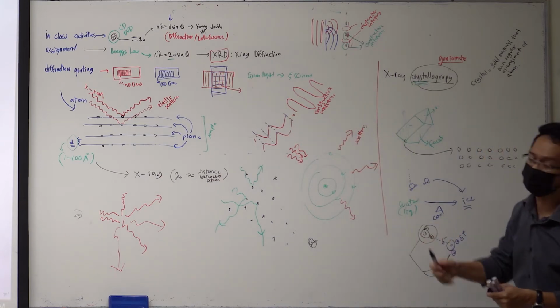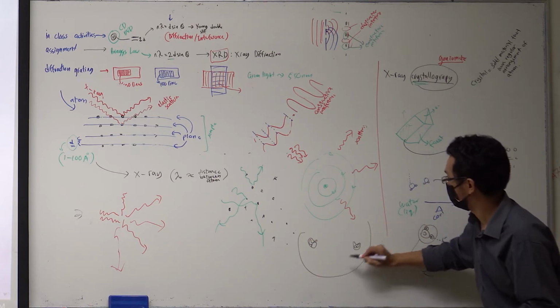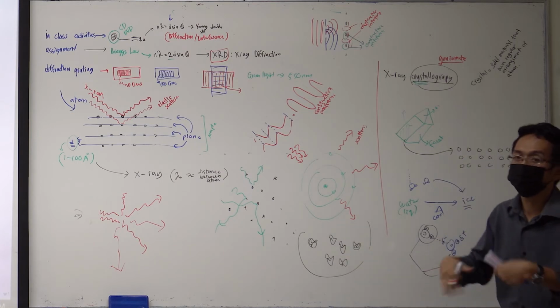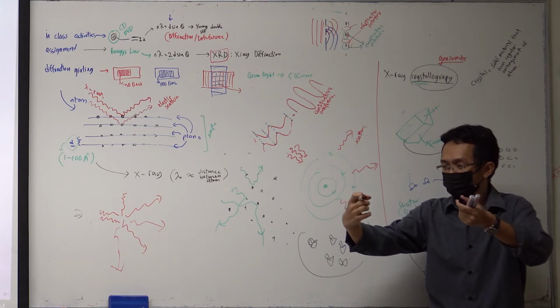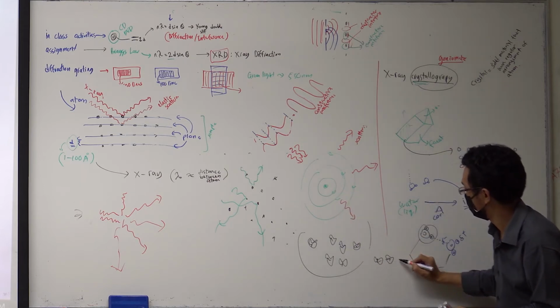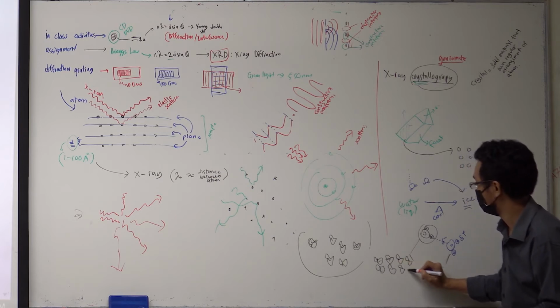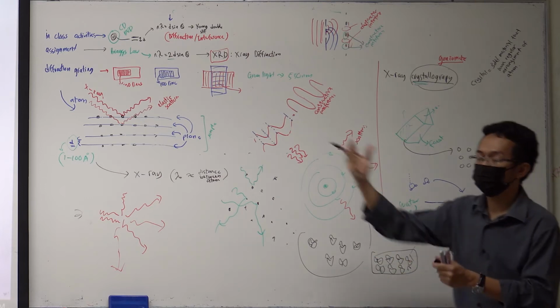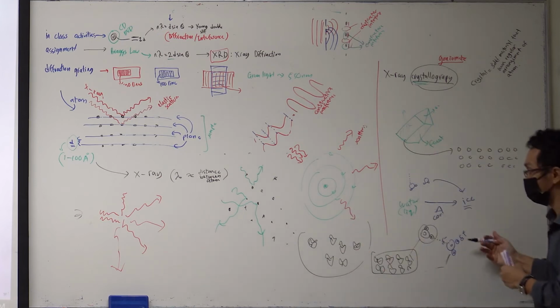So what they do is they gather a lot of protein, they put in liquid, a lot of the same protein, and then when this same protein is cooled down, evaporated, it will be like a Lego, trying to find its match. It means they try to arrange themselves like that, and then you get the crystal, you get the solid protein. So from this, you put it in the XRD machine, and then you shine the X-ray, and then you get the pattern.